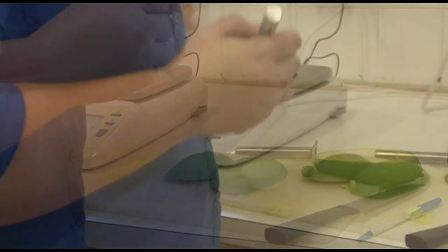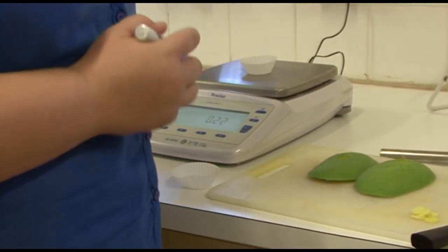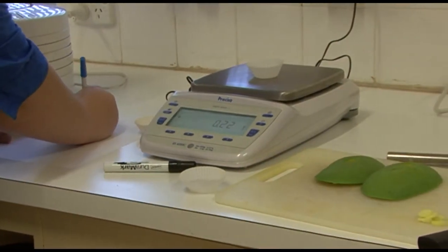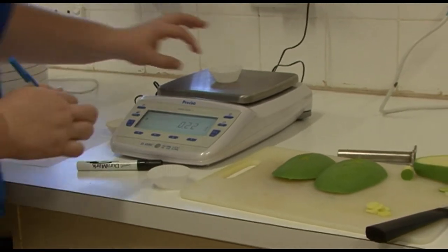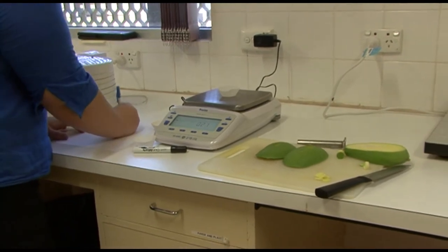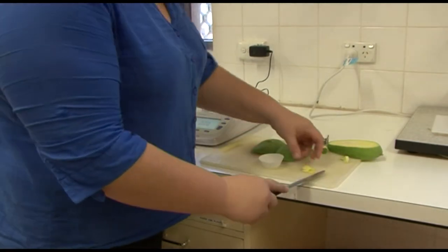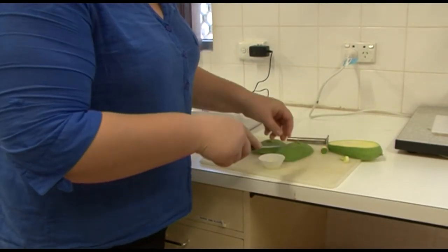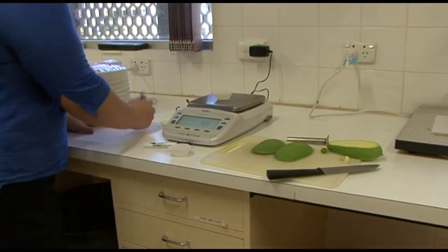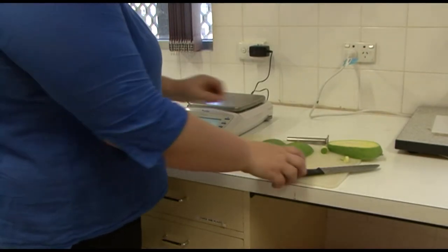We label two patty papers one and two for the two sides of the mango. We weigh them and record that reading. Do the same for the other one. Then we put the sliced plug in the patty paper and take the wet weight and record it. Do the same for the other plug.